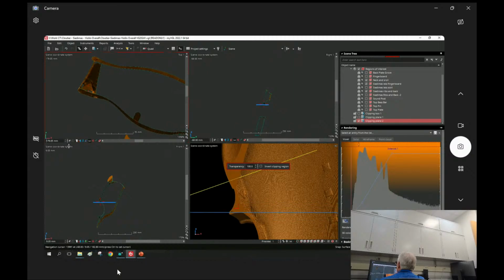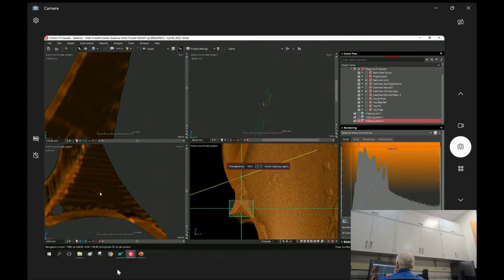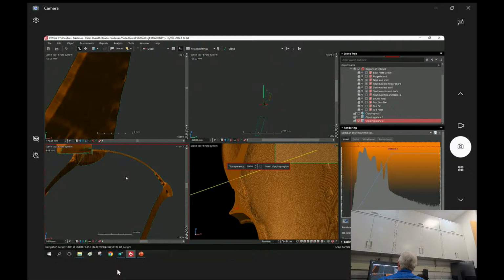One of the things that they were looking at was what type of wood was over here, and that's not the easiest way to see that. So if I come over here, I can see this wider grain spacing. So some of it was spruce, some of it was something else. I can't remember offhand, but it was fairly easy to tell, willow. But again, if I've got a $1 million violin or something I suspect to be a $1 million violin, I don't want to have to open it up to determine whether it is or isn't.